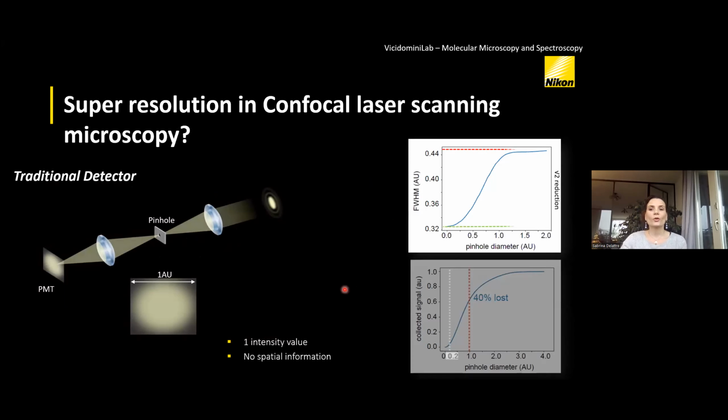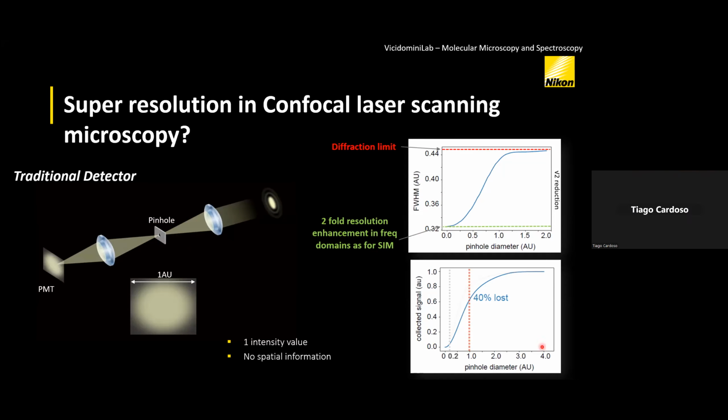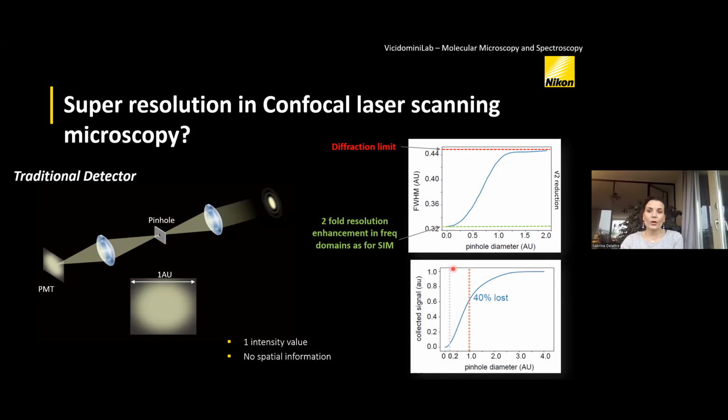But the resolution of a conventional microscope is limited by the diffraction limit of light, and the AX series remains a point scanner confocal with its inherent employment of a pinhole for better sectioning and rejection of out-of-focus light. To improve the lateral resolution, the pinhole needs to be closed to the minimum size, providing a diffraction-limited imaging system. There is a trade-off between the light collection efficiency and the resolution.